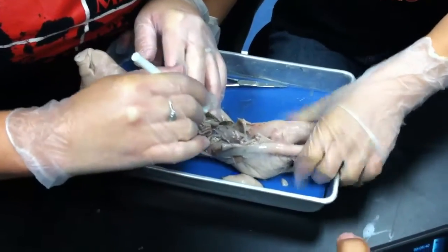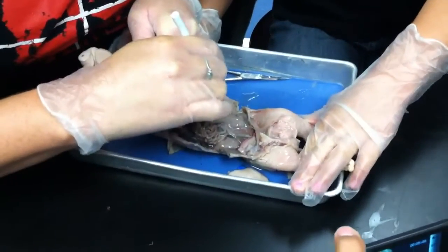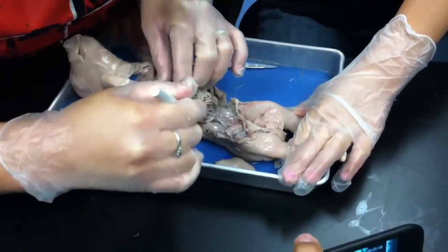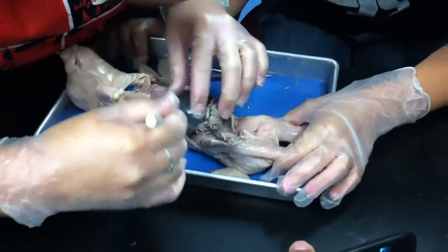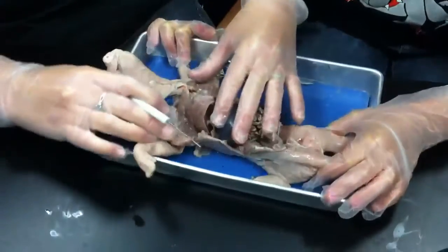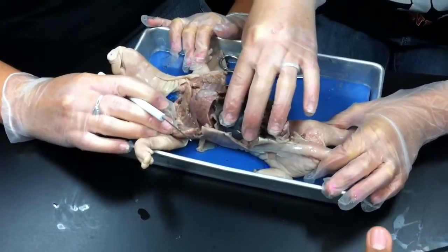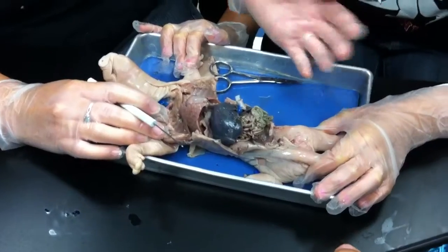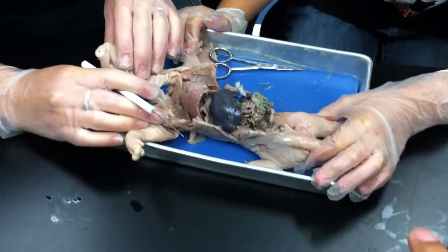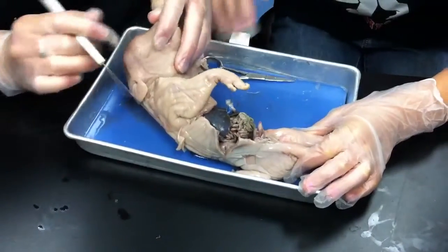What are these two things back here? Kidneys? Yep, those are two kidneys back here. Some big kidneys. I'm not sure exactly when this came out of in utero, like how far along it was. Obviously, it must have been in the third trimester, because it seems pretty developed. Just the eyes. When we look, the eyes are still shut.